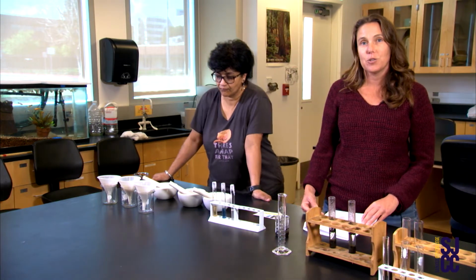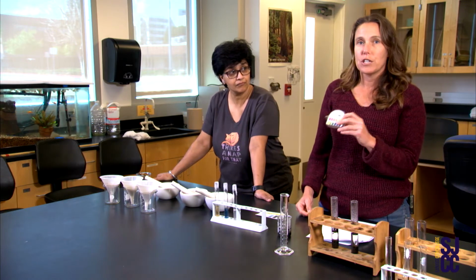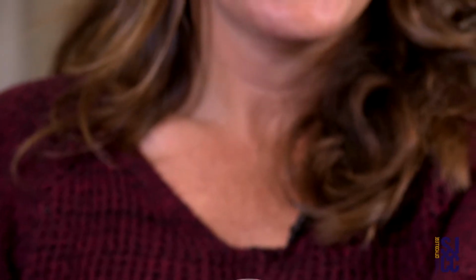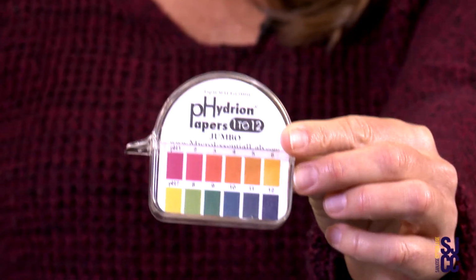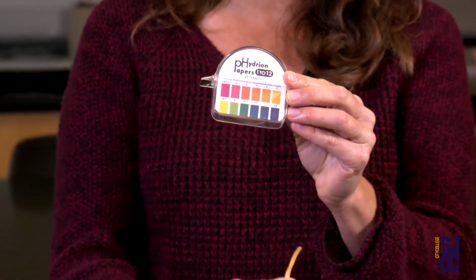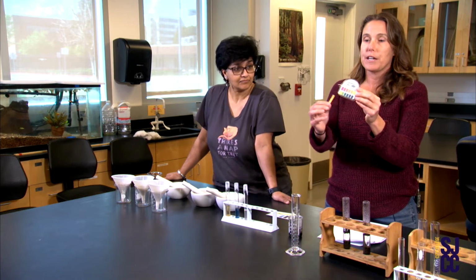All right, so we're going to jump right into some of the chemical experiments of the soil type analysis, doing it with the pH. We have a pH meter strip, and the pH measures the hydrogen ions. Basically, it's a negative logarithm of the hydrogen ions. We are using a pH strip to look at the color code to identify the pH of our soil. Sometimes people use a pH meter, which gives you a numeric value, but right now we're just using an indicator strip to tell us with the color coding.